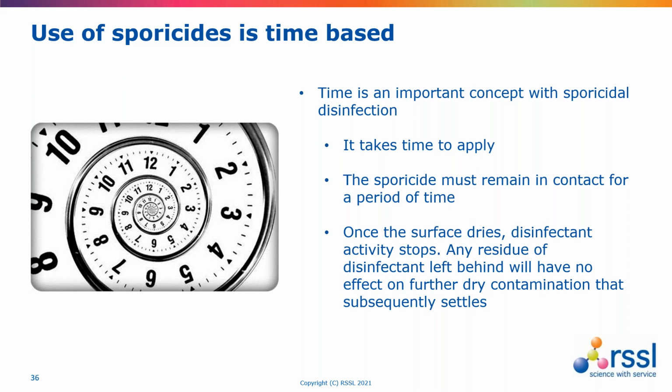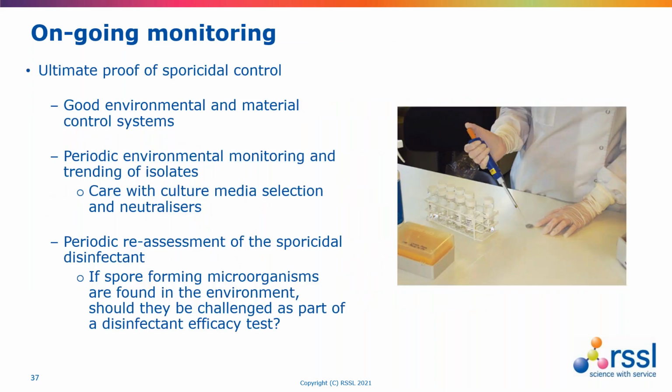And when we carry out disinfectant efficacy studies in terms of this environmental factor, where most disinfectants are evaluated at 20 degrees Celsius, if we're going to use a disinfectant sporicide within a cold room, then it's quite likely that contact time will increase substantially, and we need to know that the disinfectant is efficacious under those conditions.